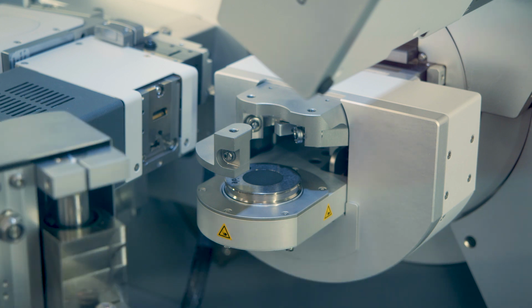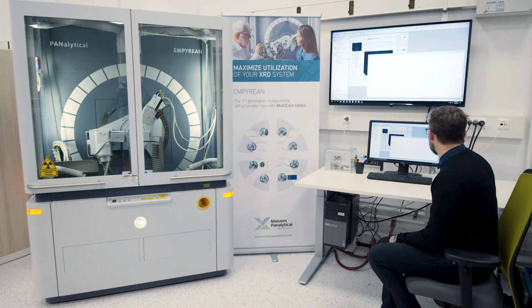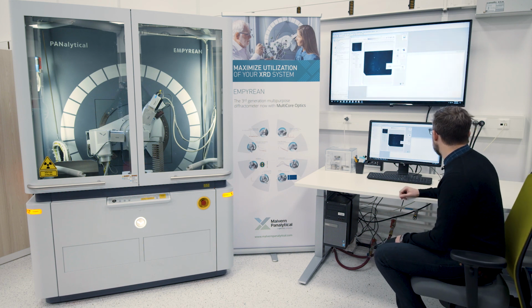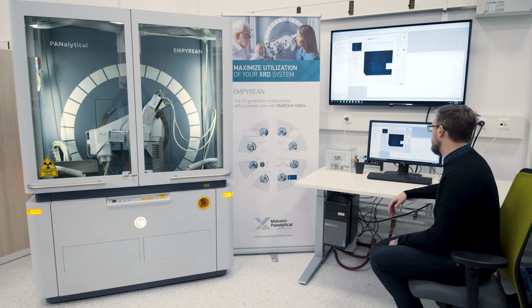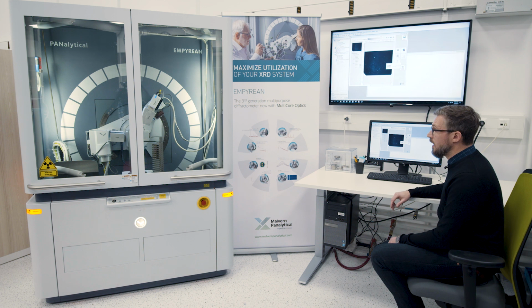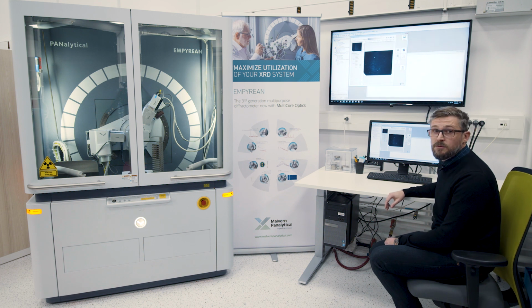This will be followed by our camera that we have here in the background. That camera can be used for documentation of sample surface effects, for example, that allow you to also investigate after measurements. For example, if you see something strange in your data, you have a chance to check if the sample surface was okay or if something happened to the sample during the measurement.